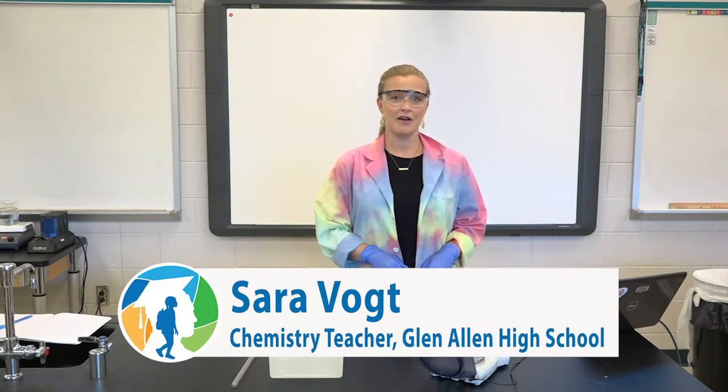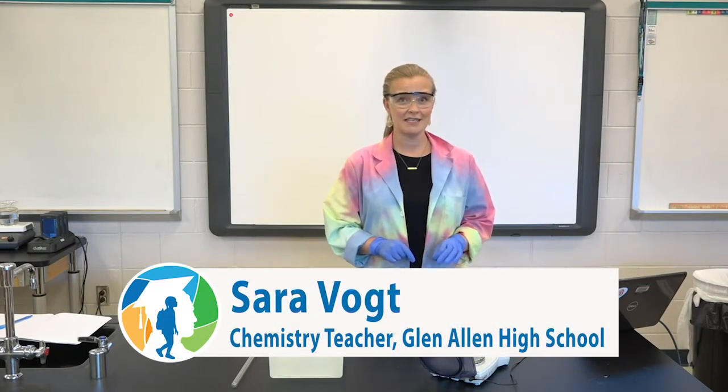Today we are going to be trying to experimentally figure out the molar mass of butane gas, and we're going to do that by using an old Bic lighter.